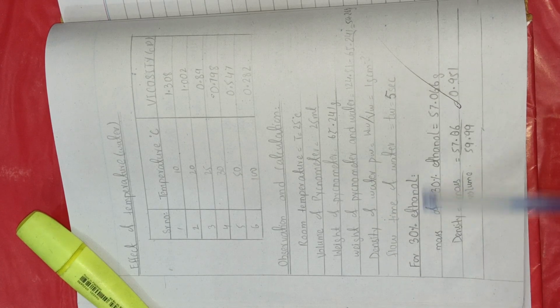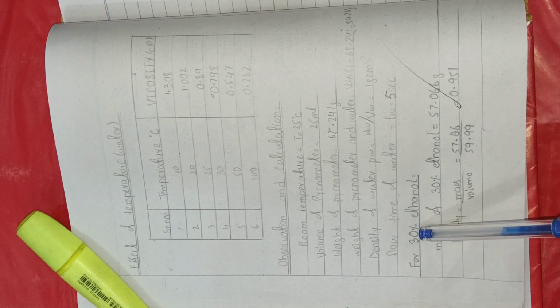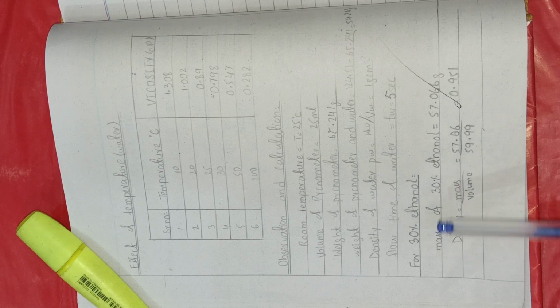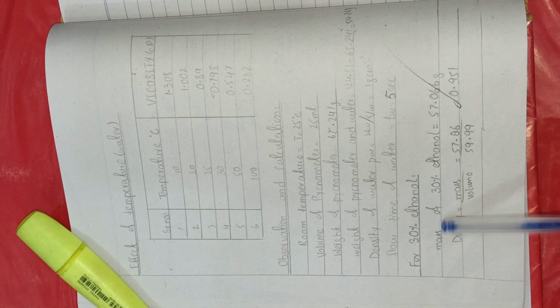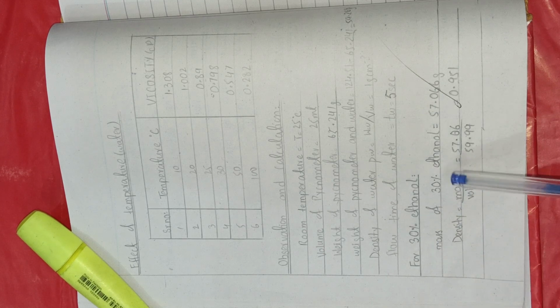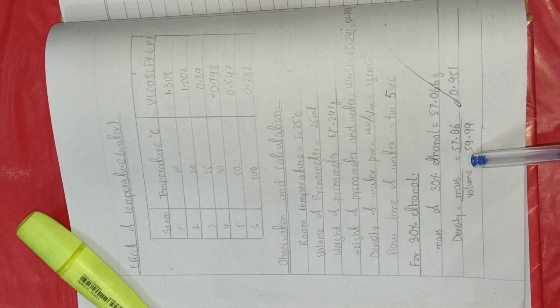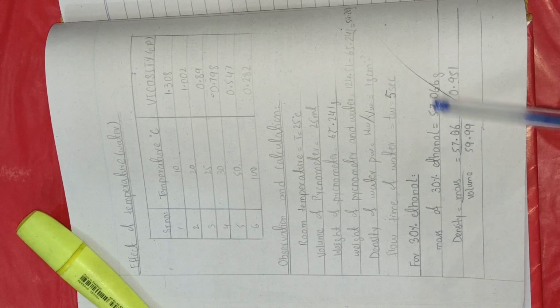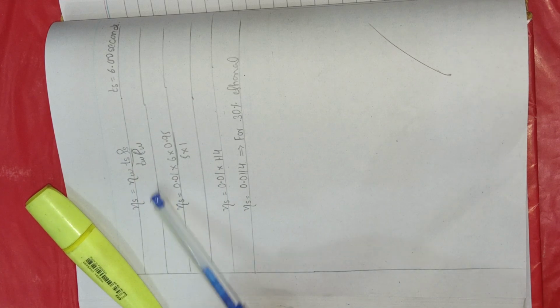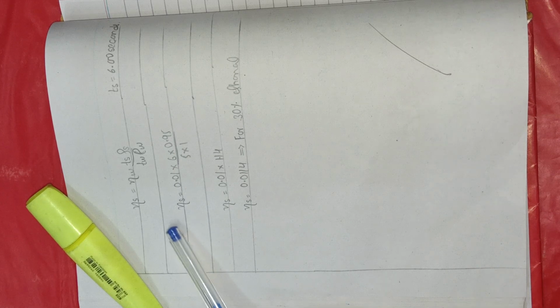So now the first pharmaceutical product given to you is 30% ethanol. So you have to find out the viscosity for it. First you have to prepare the 30% ethanol, and then you will weigh the mass of it. So the mass of 30% ethanol is this. Then you find out the density of it by dividing the mass by the volume of this 30% ethanol, and you will find out the density of that compound. At the last, you have to put all the values in that formula to calculate the final viscosity.